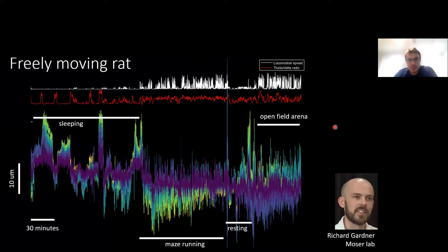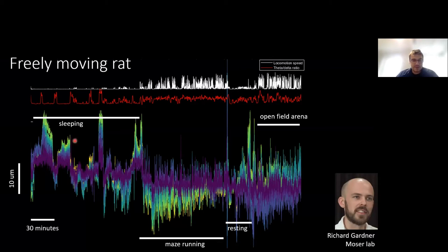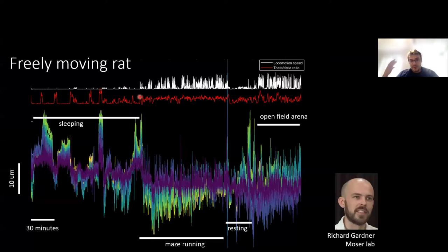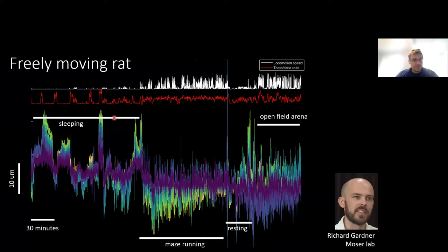This isn't just a problem for head-fixed Neuropixels recordings. Here's data from a freely moving rat — from Rich Gardner in the Moser lab — over something like six hours. You can see quite a lot of drift that also changes across channels. So even in the freely moving case, where you'd hope electrodes have stabilized after several days, there is still drift. That shouldn't be surprising because the brain is suspended in fluid and jiggly — even during sleep and rest there's drift, and of course faster drift during running and in an open field arena.